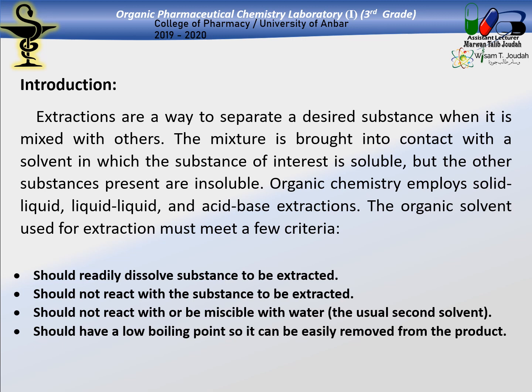And now the mixture is brought into contact with a solvent in which the substance of interest is soluble but the other substances present are insoluble. اللي دا يصير هنا one of the substances اللي راح نشتغل بيها لازم تكون soluble، okay، والباقي غير soluble. يعني for instance as we mentioned previously بالنسبة للأسبرين، أسبرين قلنا tablet contains like let's say 0.3, if we use 0.5 grams, 0.3 grams or 0.35 grams of pure aspirin الأسيتيلساليسيليك acid اللي هو الأسبرين. Okay, and the rest is the fillings, additives and whatever.